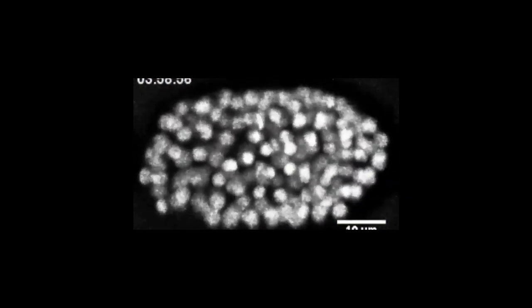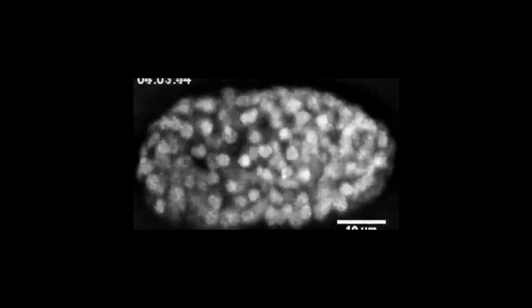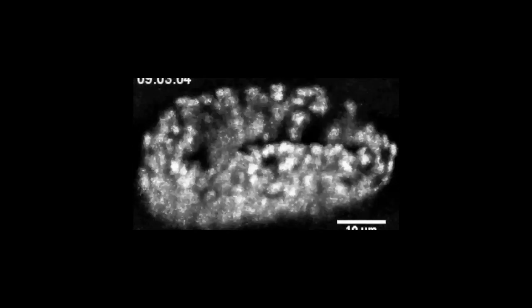With a conventional microscope we would have to expose this embryo for 14 hours of continuous illumination and that would kill the animal because it will receive too much light and it will burn. Our microscope is much faster and exposes the animal to less light. Therefore we can visualize the entire development of the animal without causing harm.